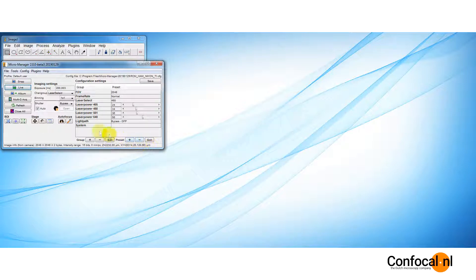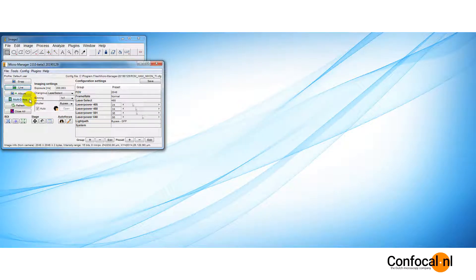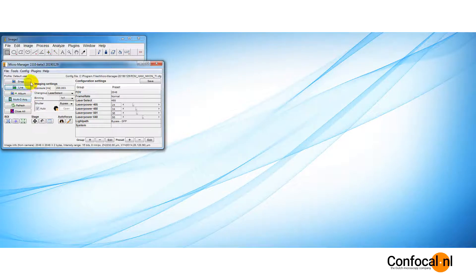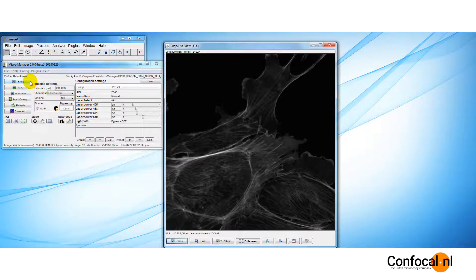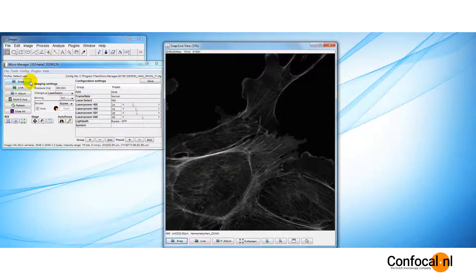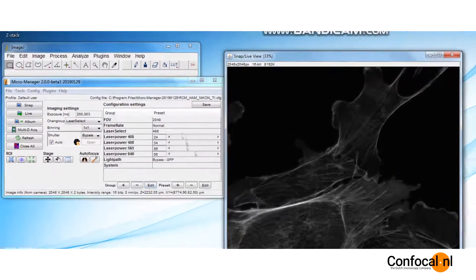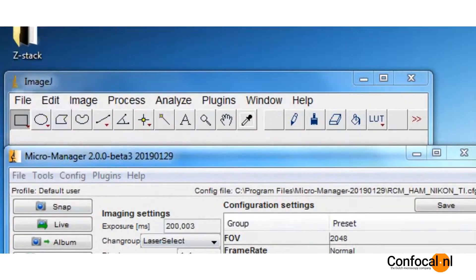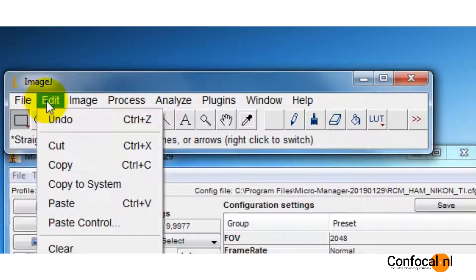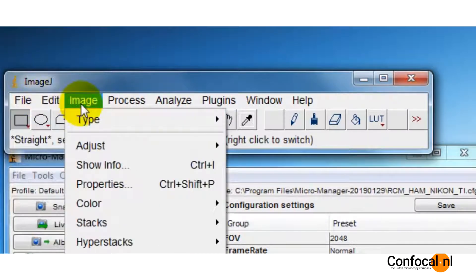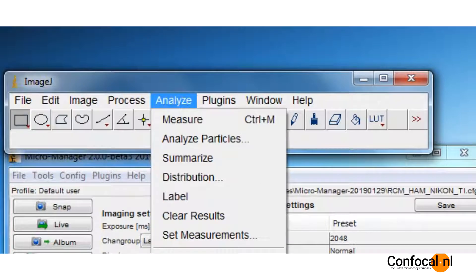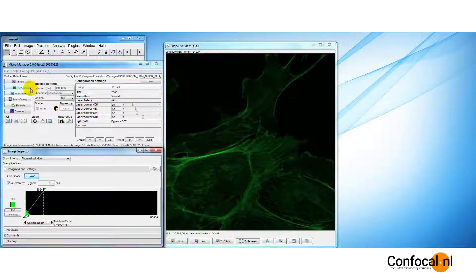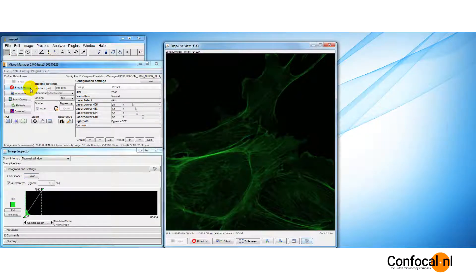On the left side, the imaging modes: Snap, Live, Album, Multidimensional Acquisition. To obtain a single image from the camera, press the snap button. A display window will pop up with the acquired still image. You can use any of the available ImageJ tools to analyze, save or edit the image. The Live button gives you a stream of snapped images.